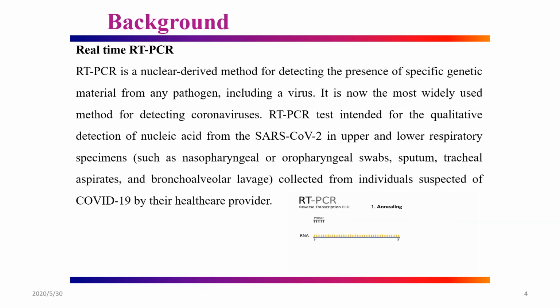So first we split the RT-PCR into two steps. First we have the reverse transcription. And what happens here is that we need the primer to anneal to the RNA template. The second step is the cDNA synthesis, and this is done with an enzyme called reverse transcriptase. Reverse transcriptase binds in the primer region and is now synthesizing the DNA nucleotides, the new cDNA strand.